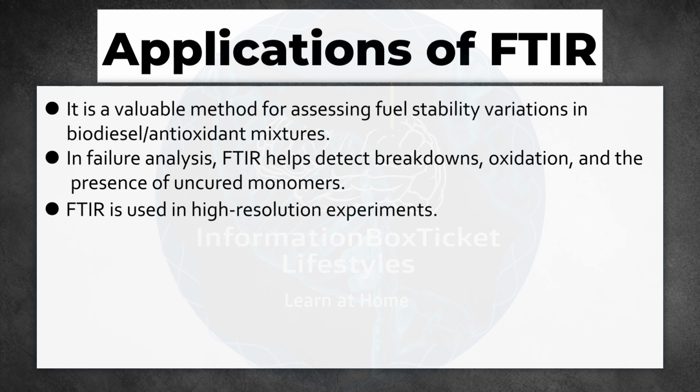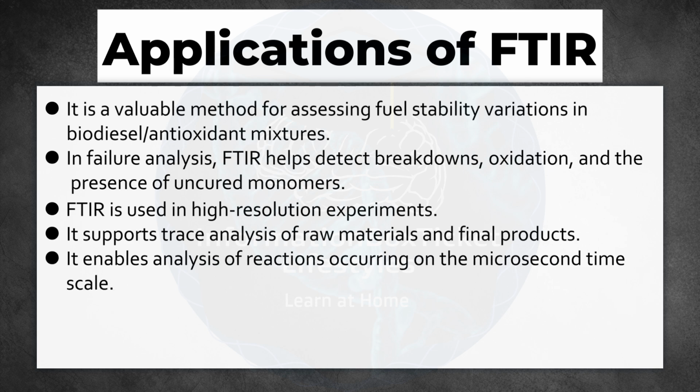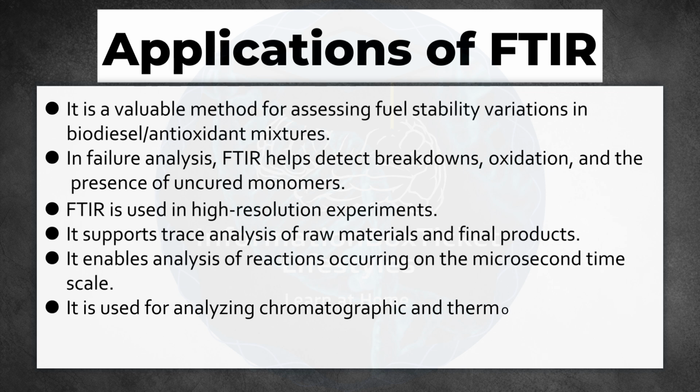FTIR is used in high-resolution experiments. It supports trace analysis of raw materials and final products. It enables analysis of reactions occurring on the microsecond time scale. It is used for analyzing chromatographic and thermogravimetric sample fractions.